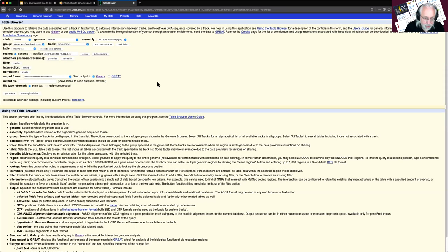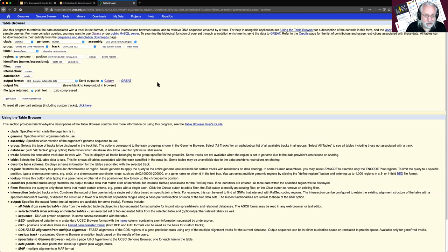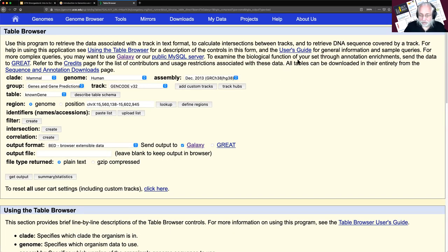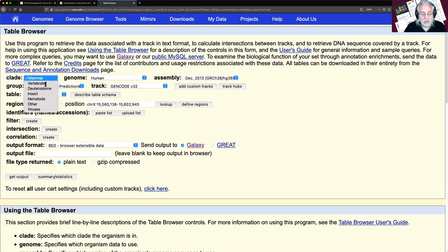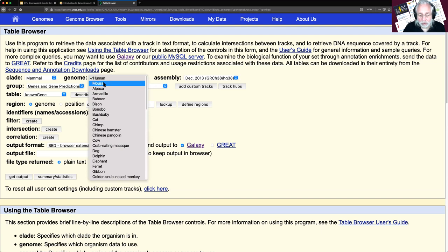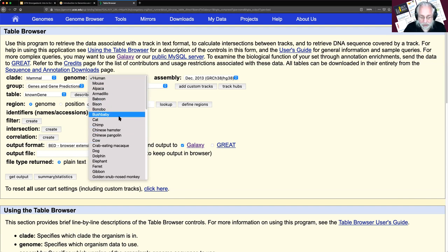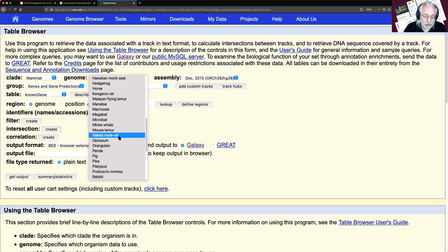I clicked on that and it takes us to UCSC. This is the Table Browser — we're trying to get information about genes on human chromosome 22 specifically. It's a big form but the defaults are pretty close to what we want. It has information about mammals, vertebrates, insects, nematodes, and more. We want mammal, human, which is preselected. If we were working with mouse, armadillo, Chinese hamster, pangolin, or naked mole rat — it's all here.